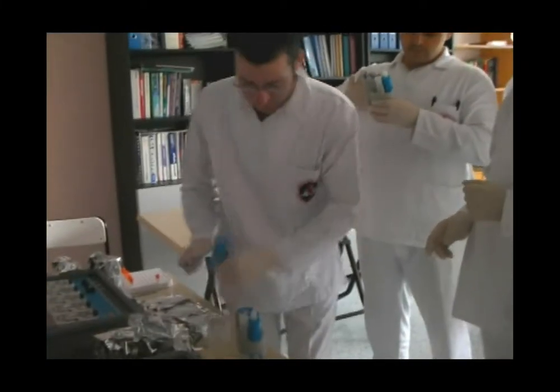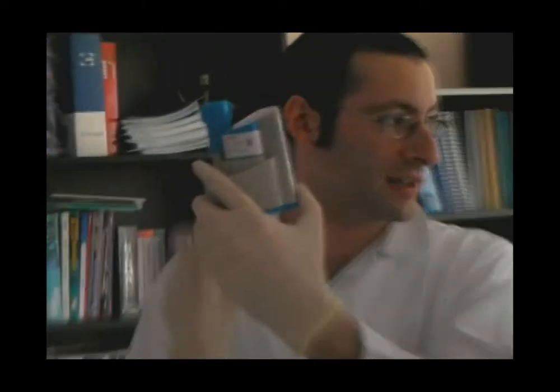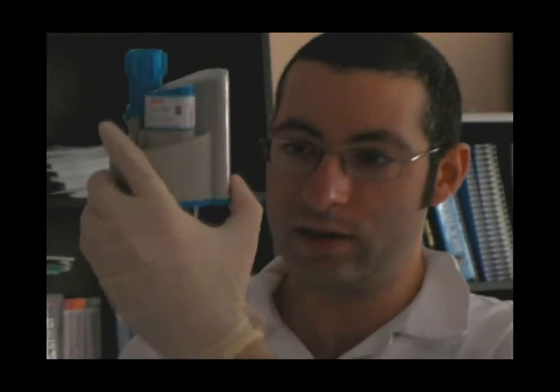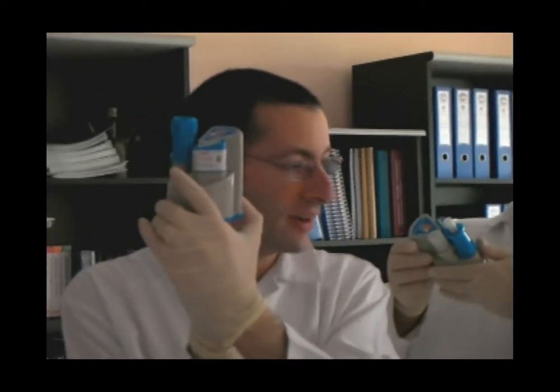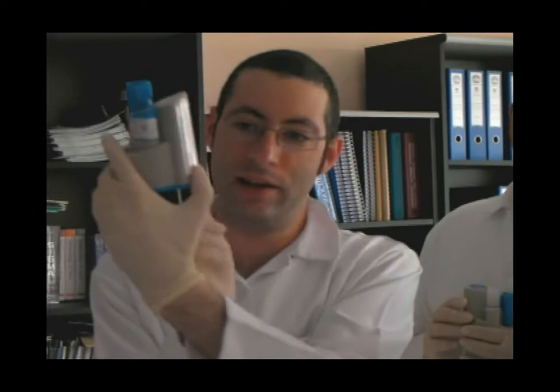Hold it up and make sure you don't tip it down because there's sample in there. Just put the screwdriver under there and wiggle it. When you first put it in it will feel very tight, then you wiggle it and it becomes quite easy to turn. Once it's easy, you know that's fine.